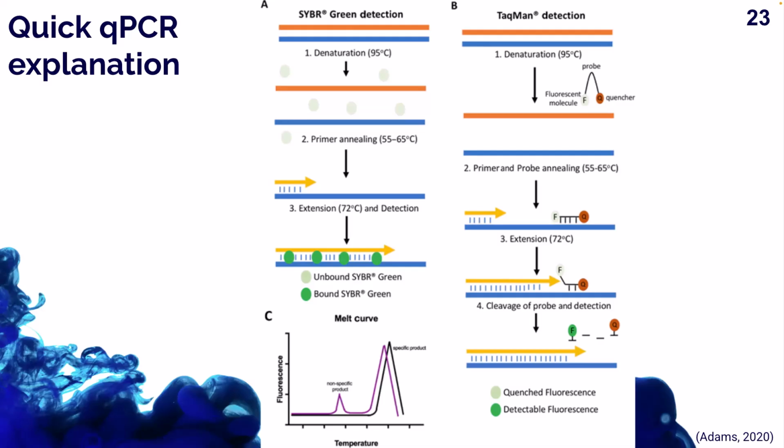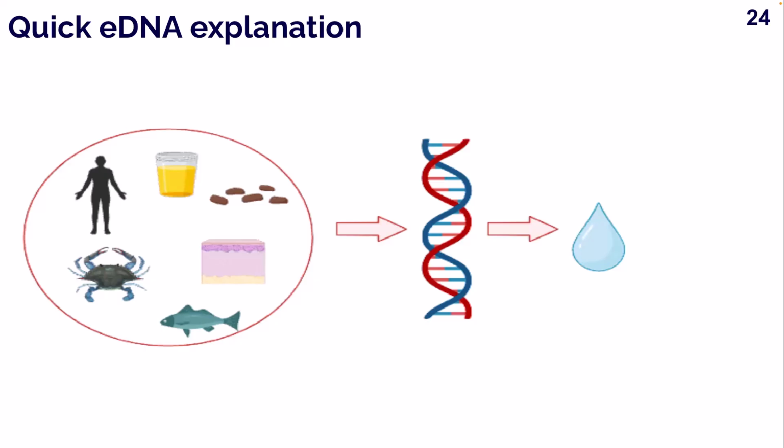And the reason why we also decided to use eDNA in specific is because we can detect eDNA in an area non-invasively and non-destructively, which is a great advantage. Because eDNA is simply just short DNA fragments from skin cells, bodily fluids, feces, or urine in the ecosystem, and can come from a variety of different types. So it could be collected from water, soil, or air. It allows us to be able to just pull that water out and see if we can get Dungeness crab DNA.